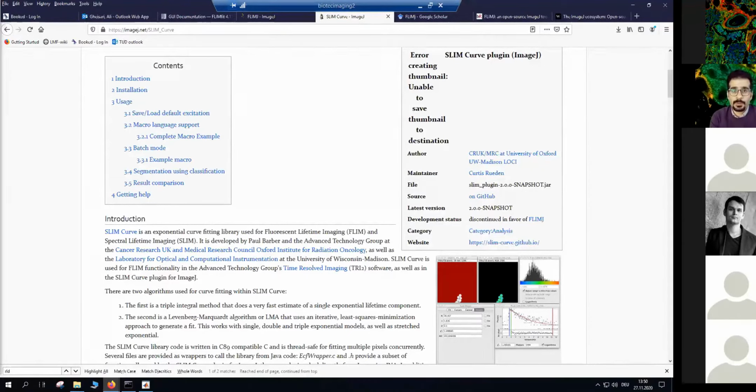Sometimes they need to develop a tool to solve their problem, and those tools are not always global enough, universal enough, to answer all the questions. So when you need to adjust, for example, the header or something in the ASCII files, that would be fitting for many open source softwares, that is coming from this non-consistency in the development team, and also the timeline of the development of any software. So I would just go on to showcase, starting with the SLIM Curve plugin.